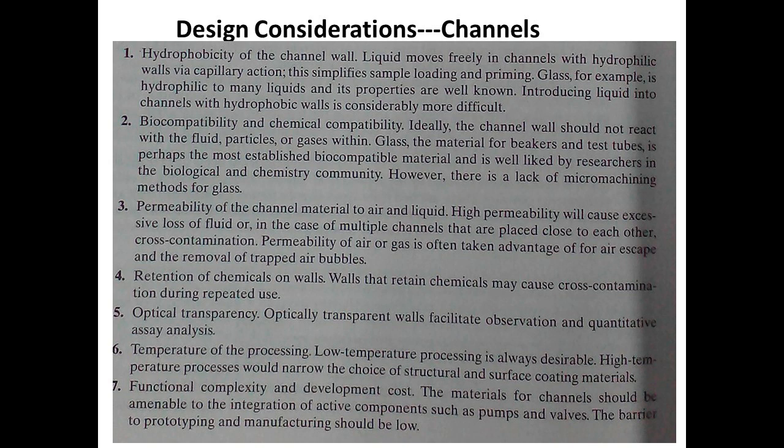But if you refer to the next slide, you will find PDMS. There are a few other types of materials which are also biocompatible. But you have to consider other factors while choosing your material, like for instance, micro machining. Glass is brittle, so it is not that good compared to others.